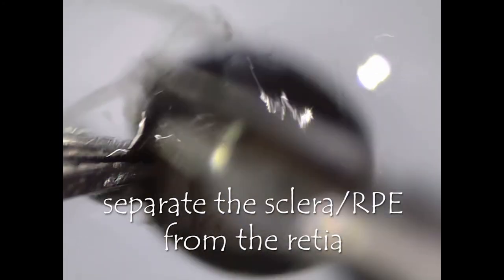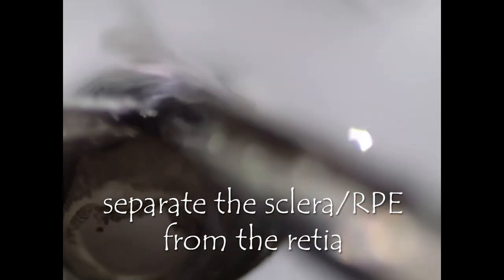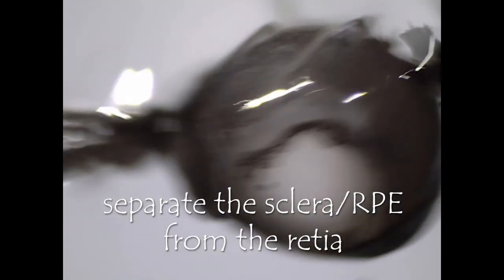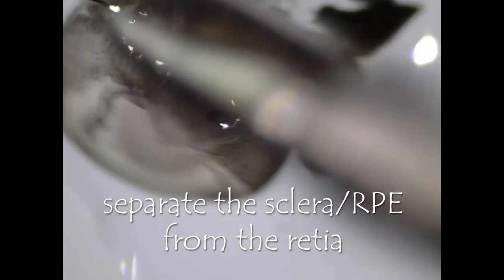Using the spring scissors, cut the sclera. Slide the back edge of the scissors between the retina and the RPE, retinal pigment epithelium.